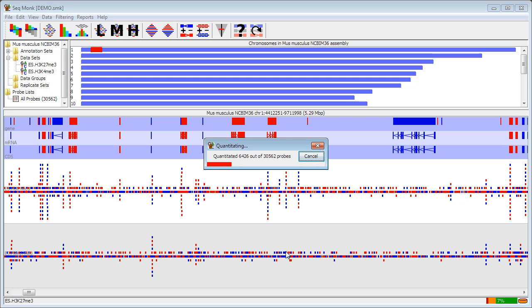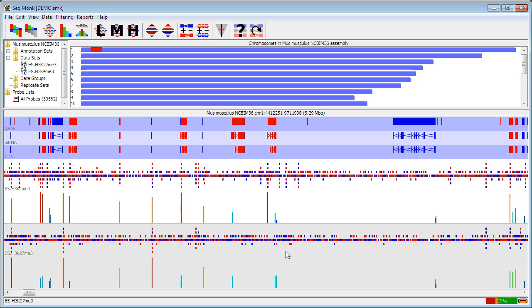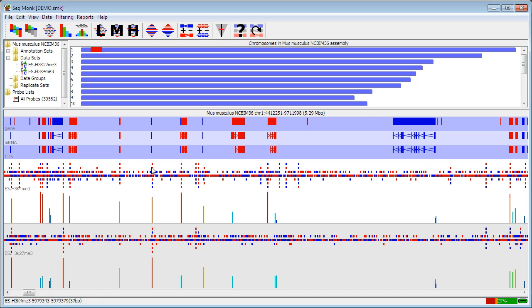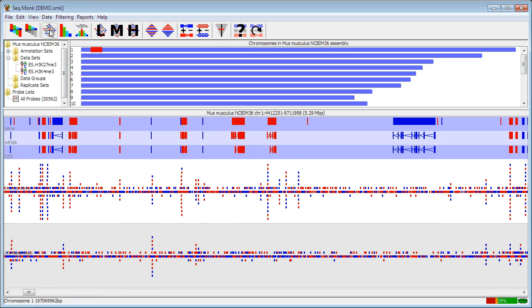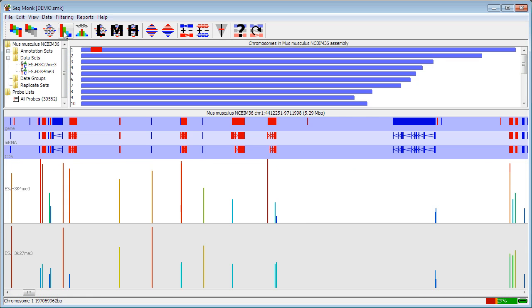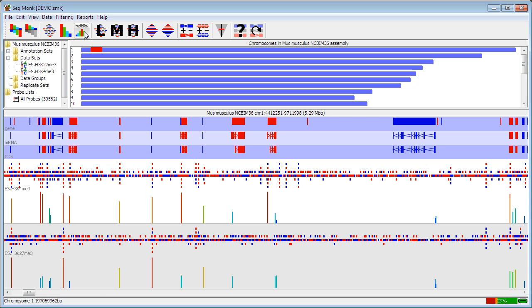And when your quantitation is complete your data track displays will now split in two and you'll see the raw data above and the quantitative data below. You can choose to display just the quantitative data or just the raw data and those options are up on the toolbar here where you can see just the raw data, just the quantitative data or both.